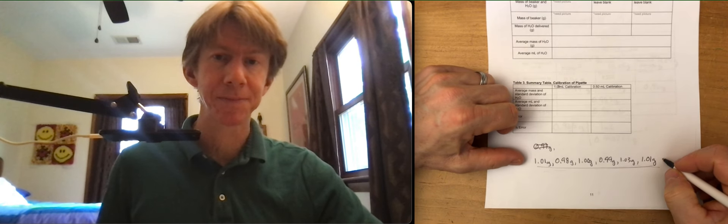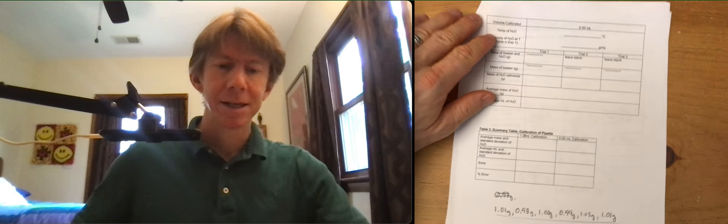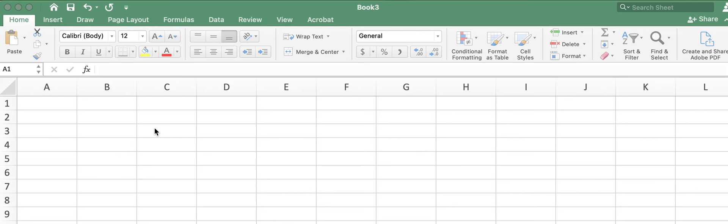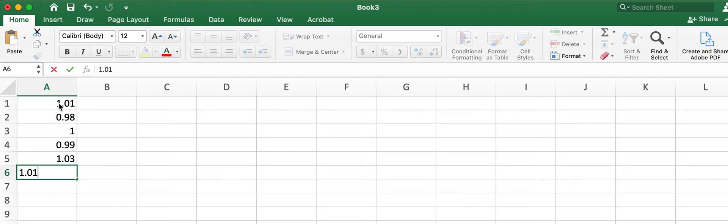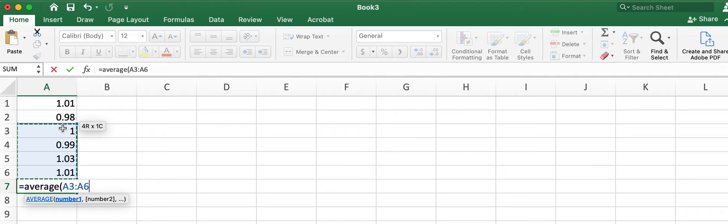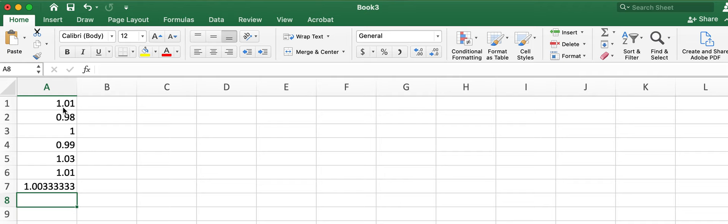So these are the six values, the good ones, and I want to average them. So I'm going to go to Microsoft Excel. I'm going to enter those six values in without units. I put in 1.00, Excel tells me one. Let's see, one, two, three, four - those are my six values. Now I want to find the average so I type in equals average, click and highlight all my values, hit enter and my average is 1.00.